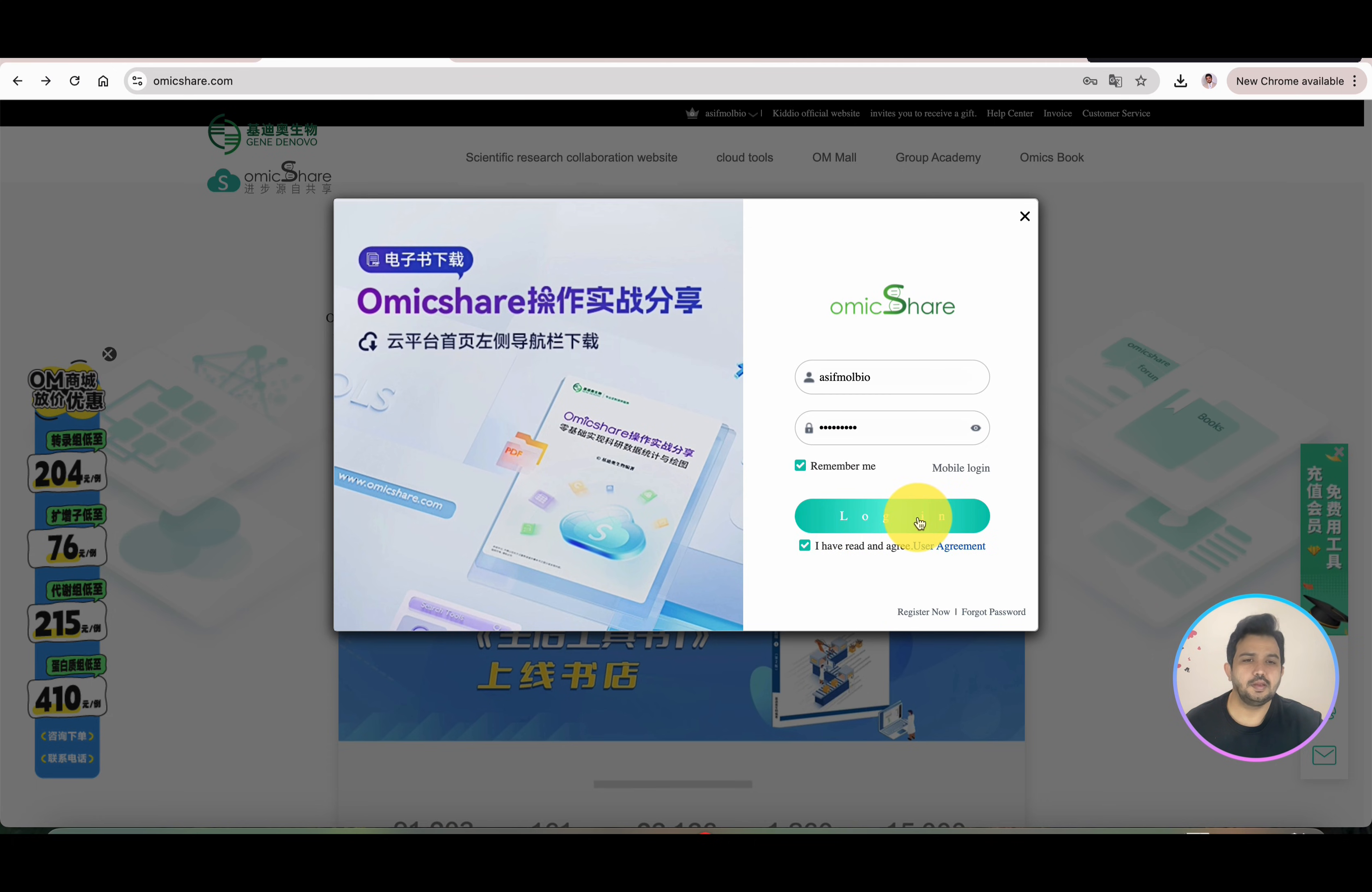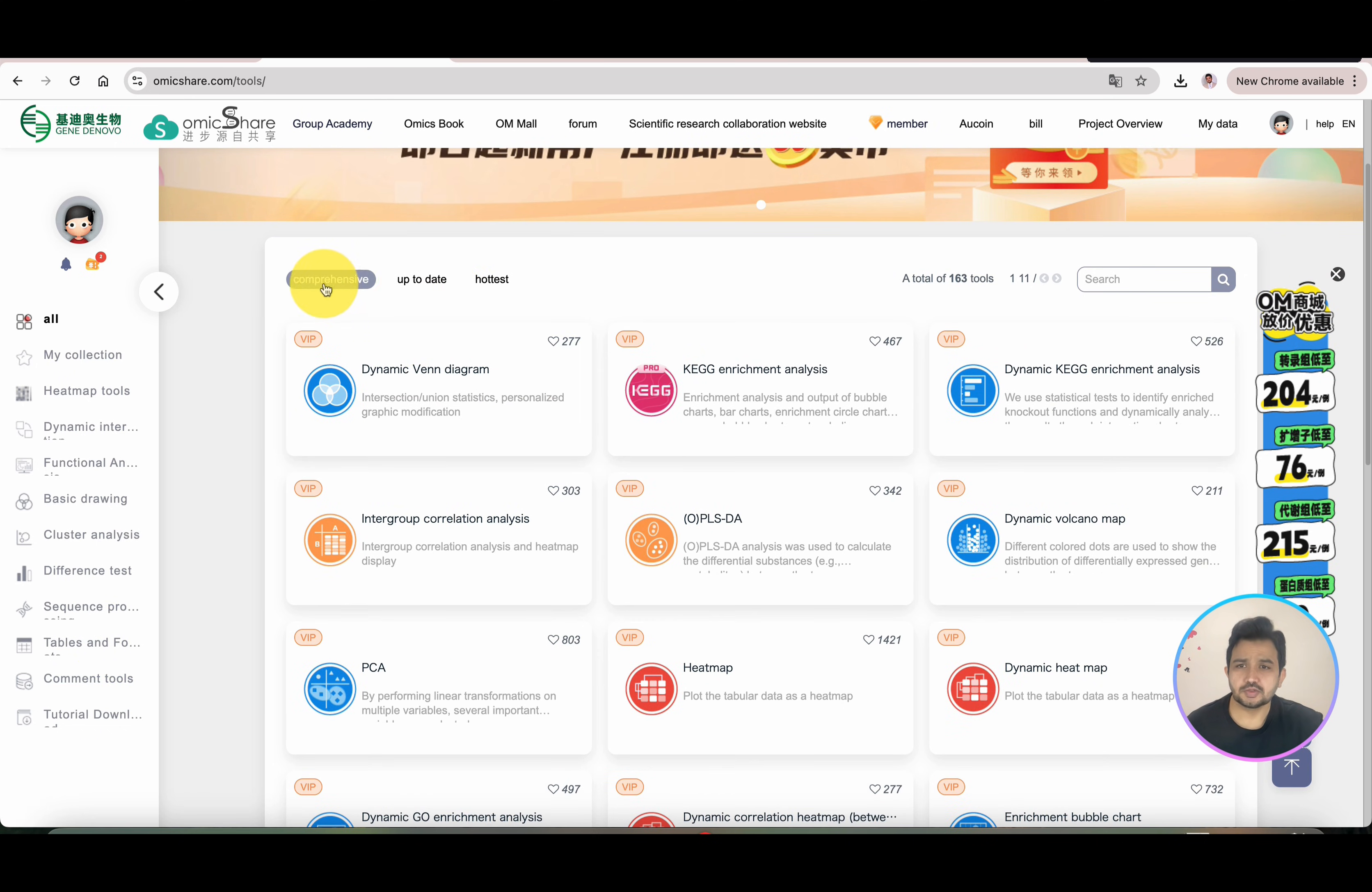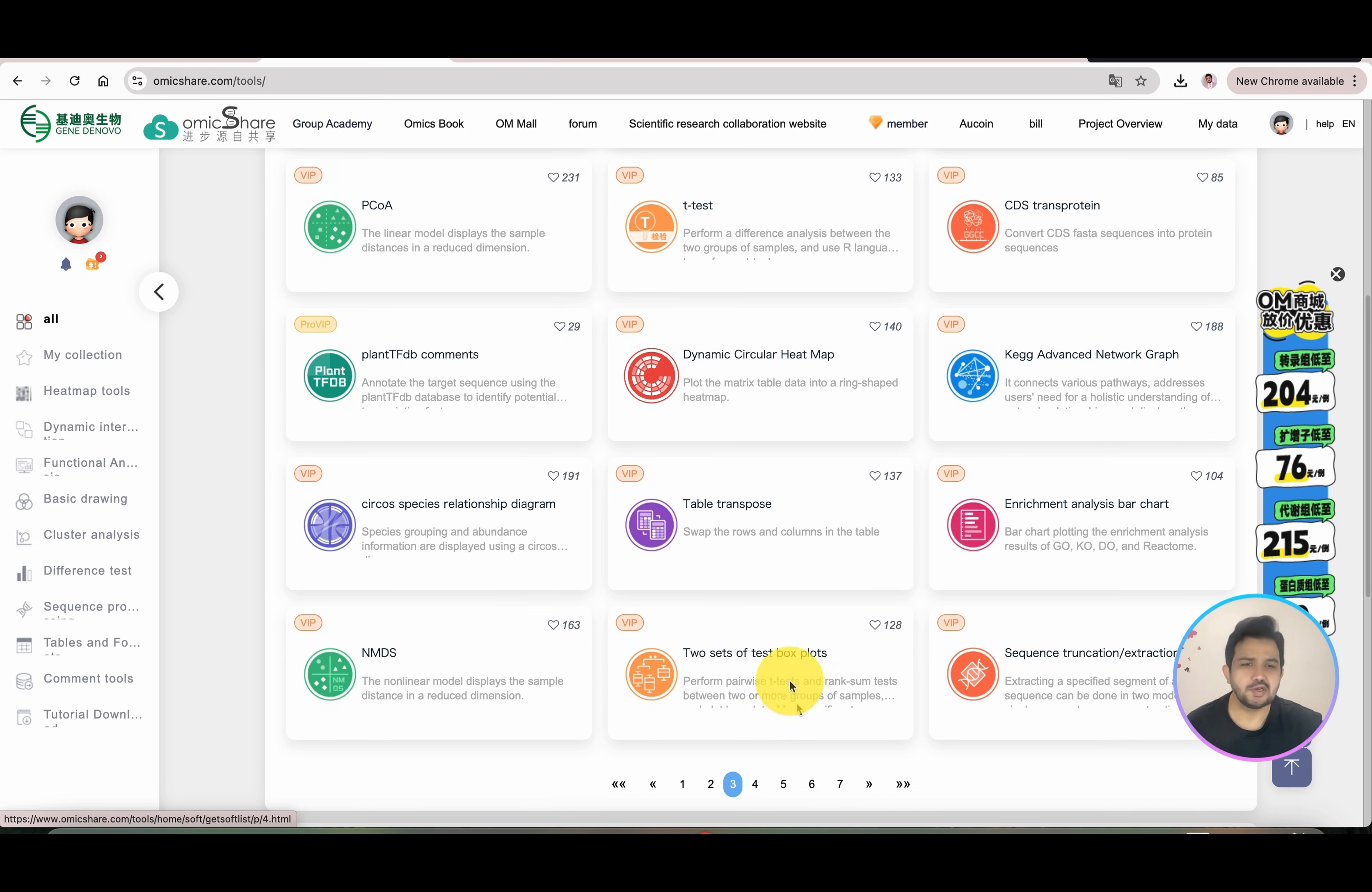Once I'm logged in, I can directly click on Cloud Tools. You can see here are different collections: heat maps including dynamic interactive heat map, functional enrichment, basic drawings, cluster analysis, different tests, sequencing reports, tables, and many more. Here you'll find dynamic Venn diagrams, KEGG pathways, PLS-DA analysis, heat maps, table filtering, volcano plots, weighted network graphs, table merging, box diagrams, and everything.